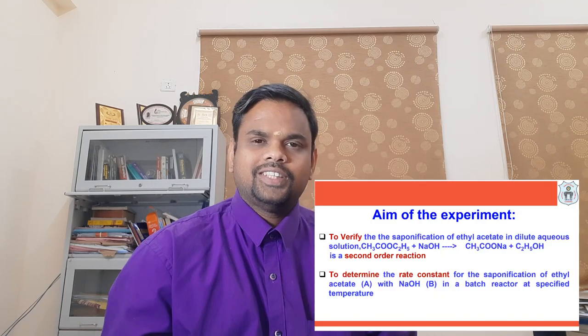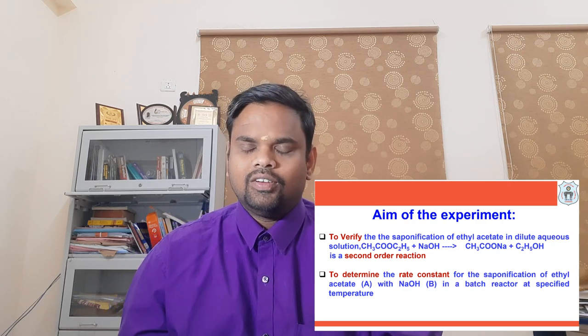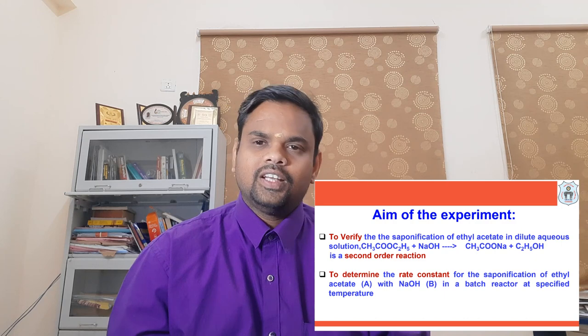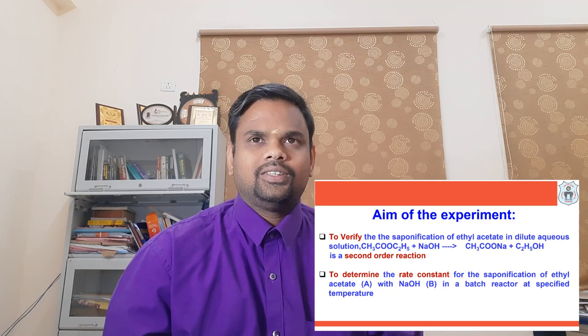The aim of this experiment is, we want to verify that the saponification of ethyl acetate in dilute aqueous solutions is a second order reaction. And also, we want to determine the rate constant of the saponification of ethyl acetate with NaOH in a batch reactor at a specific temperature.